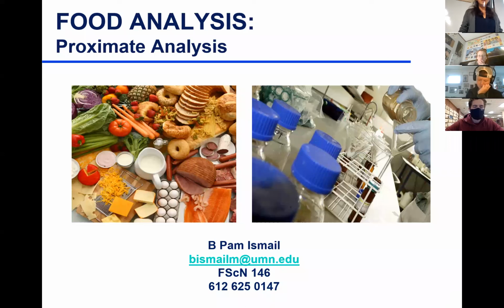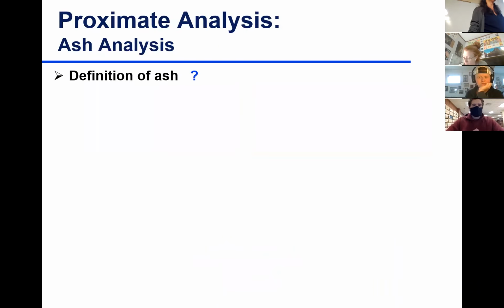Okay, let's get started. We're moving along with proximate analysis. We covered moisture. We're moving on to the next one, which is ash analysis today. So what's the definition of ash?